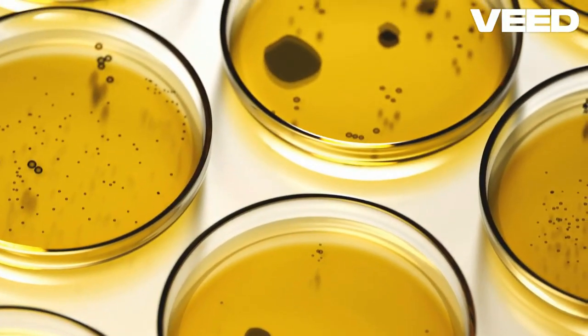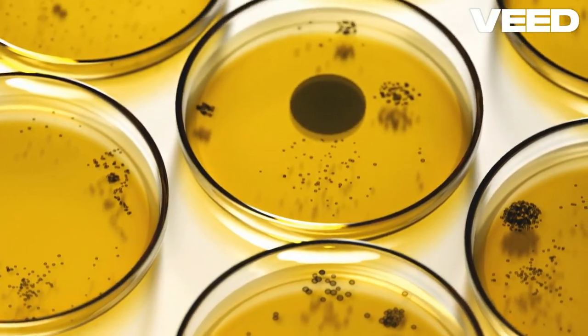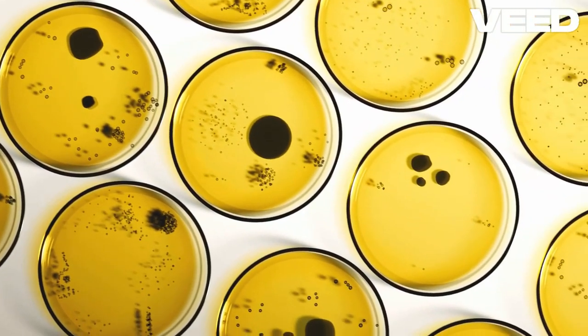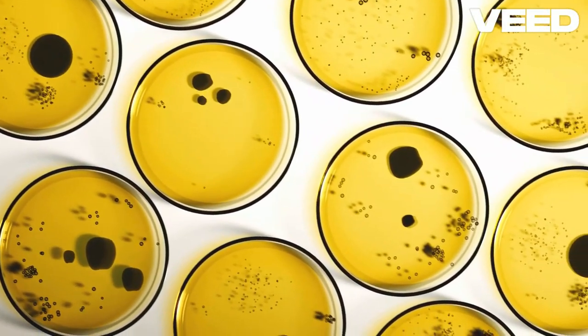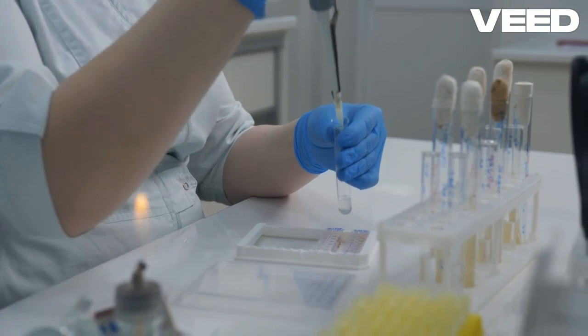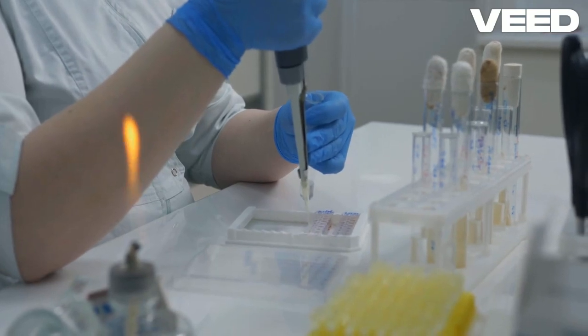Today, we are diving into the fascinating world of microbial preservation methods. Let's explore the 8 incredible techniques that scientists use to maintain these tiny organisms for extended periods. First up, we have the agar slant culture method.